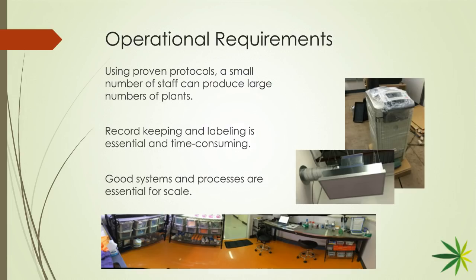And in reference to an earlier questioner that was asking about the 3 big mistakes, the third one that I don't think I mentioned is overestimating any method. Every method has a utility. Every method has a place. Micropropagation is just one method.